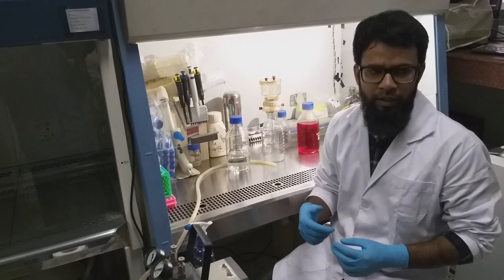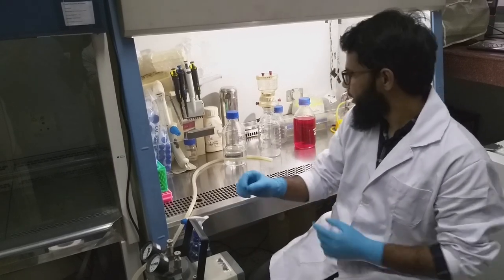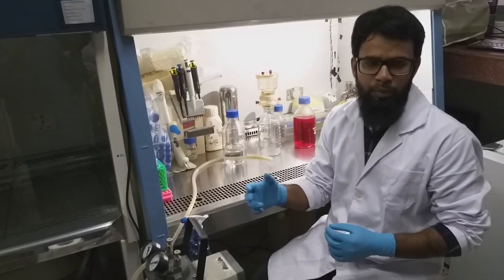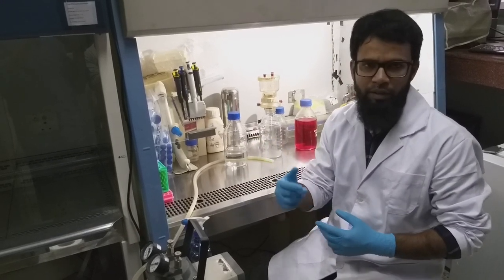Now we are going to filter the media. For that purpose, we need a suction pump which can be connected to the bottle top filter. This suction pump is for the purpose of extracting the air from the bottle top filter so that we can filter the media.